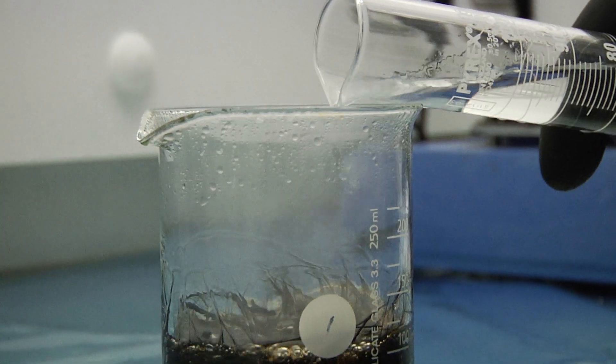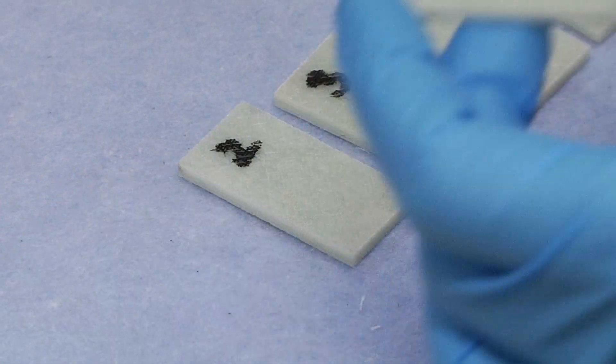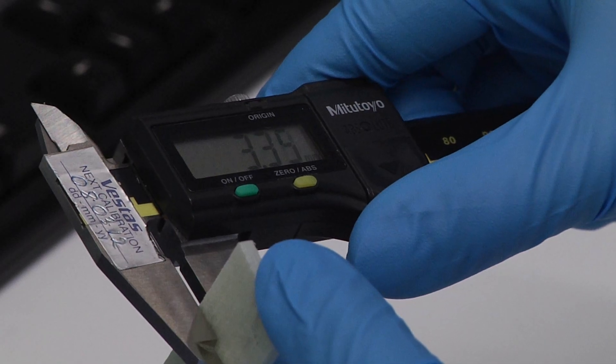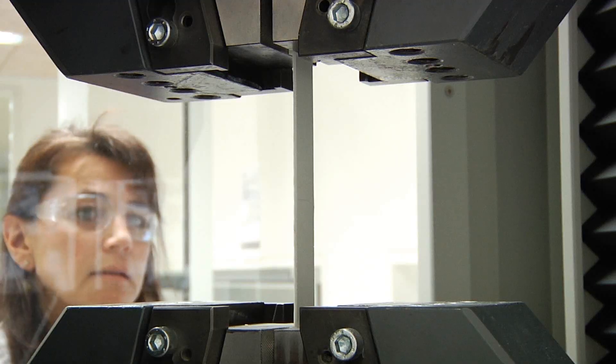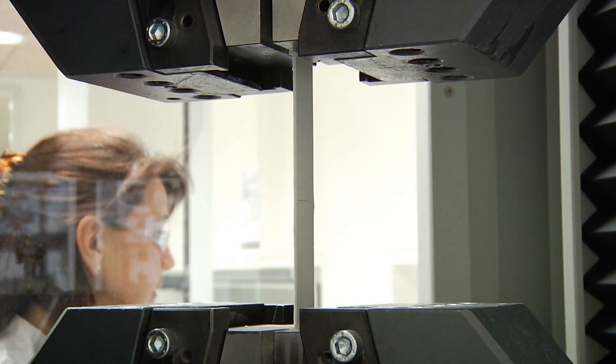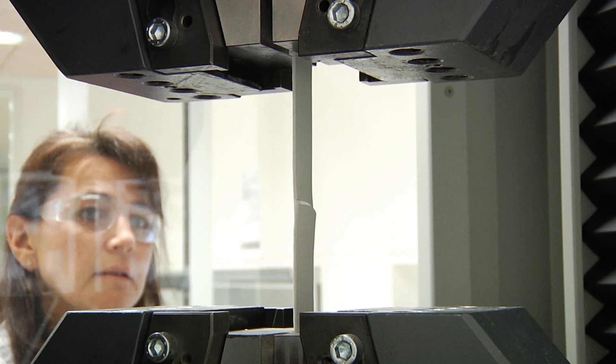The manager of the materials and process laboratory, Kasper Muftyvesen, explains that the analysis done here tests the robustness of the materials which go into the blade. Here at the laboratory we work with all the materials and processes that we use in the blades in the production and also in new blade development. What we do in the lab specifically is try to make sure that materials that we want to use are actually having the right properties.